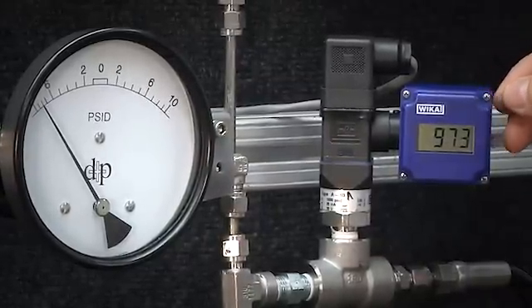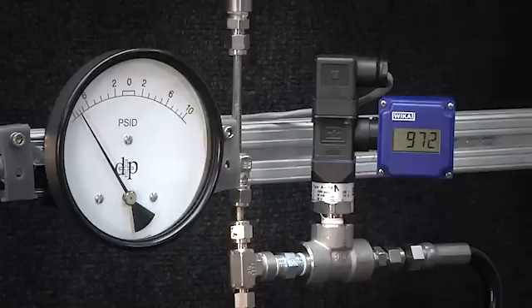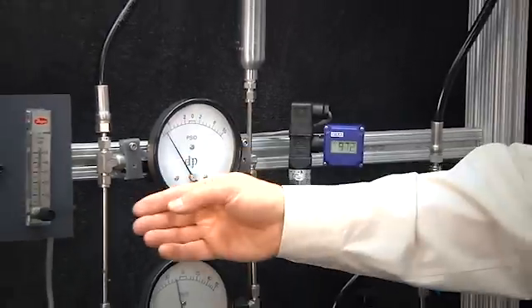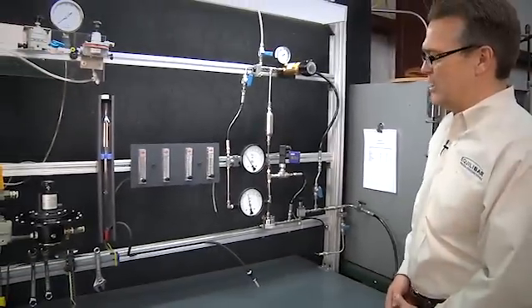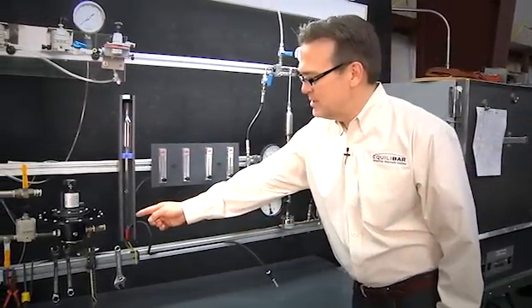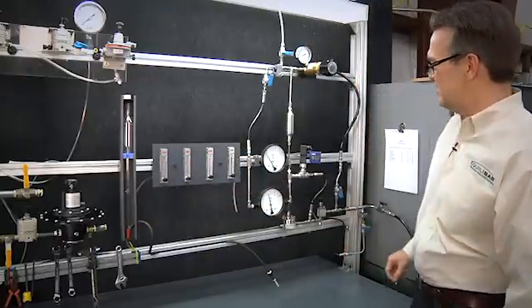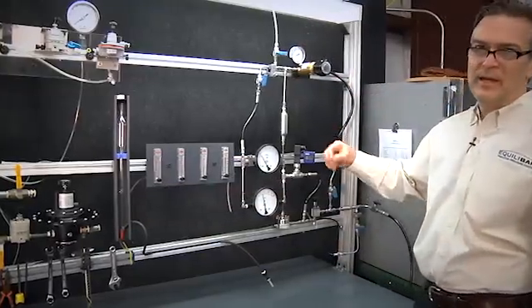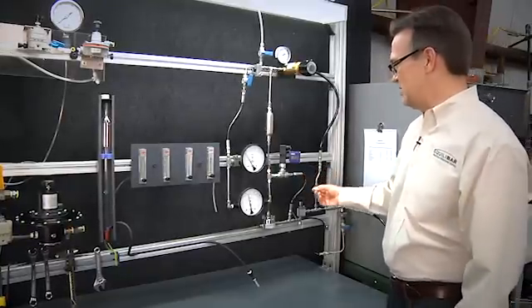Now it is coming at 972. So we have picked up a total of 3 to 4 psi, but what we have demonstrated is a range of 40,000 to 1 flow rate range. We started at about 1 cc per minute here and we gradually increased it to 40,000 cc's per minute and we picked up well less than half a percent of change in the inlet pressure.